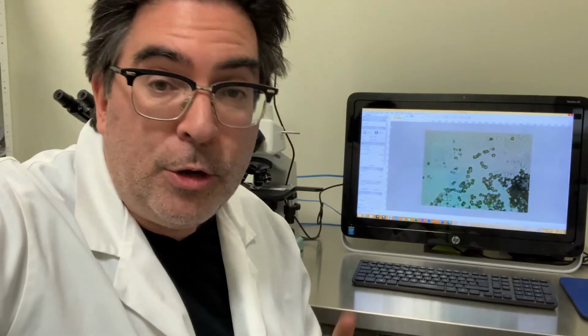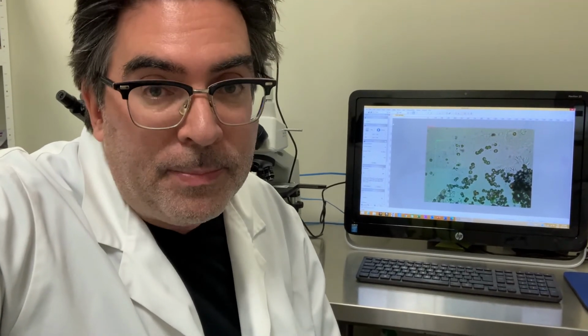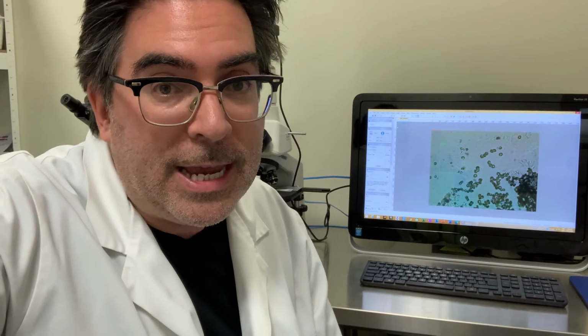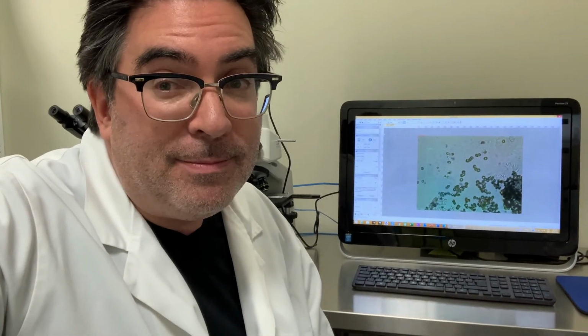But I'm going to show you what I see under the microscope in a minute, but I want to tell you that the types of bacteria that I found were typical microorganisms that are found not only in water, but also those that are respiratory pathogens, as well as microorganisms and bacteria that are typically found in urine and from the genital tract. So that's what we find colonizing inside the biofilm, as well as some black yeast. And that's a really interesting finding.